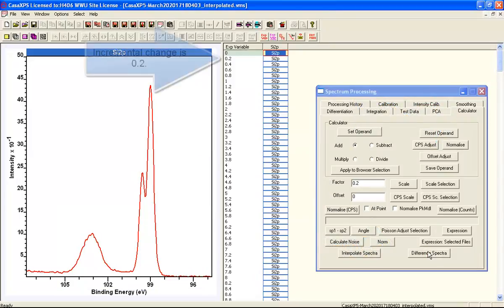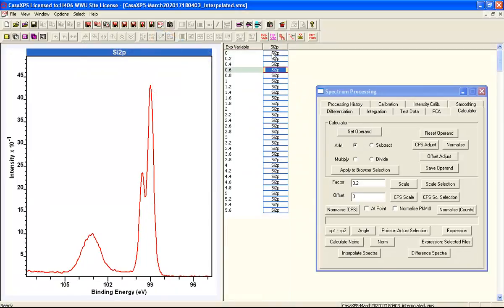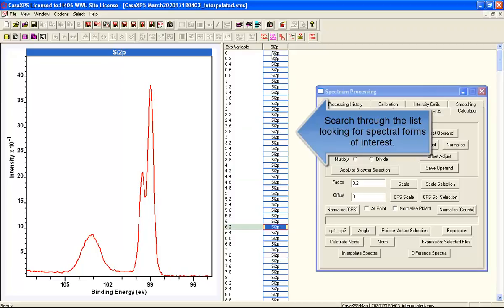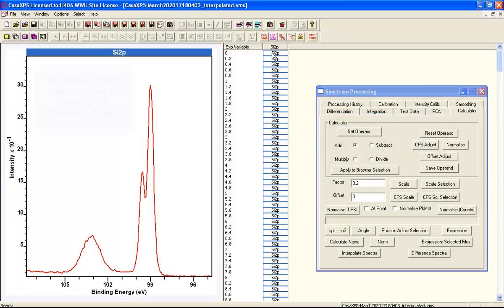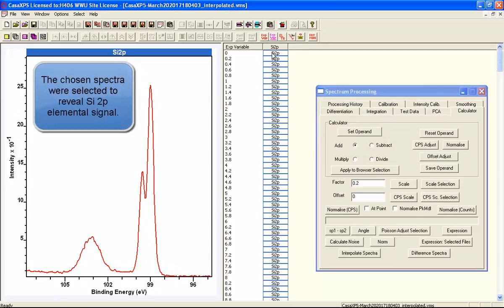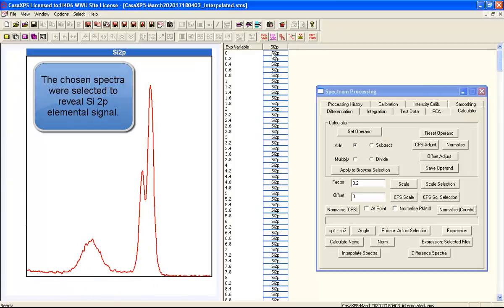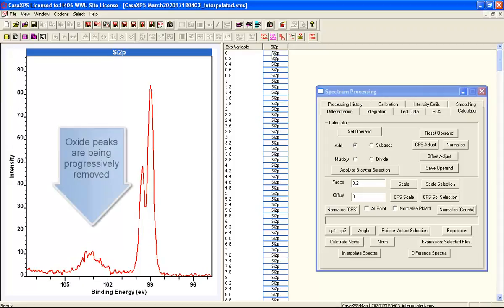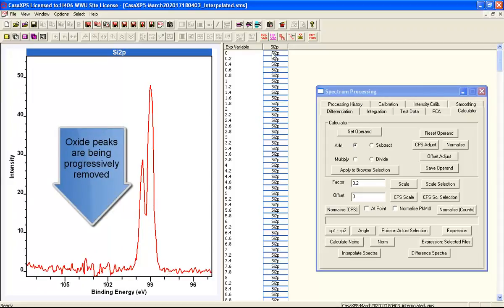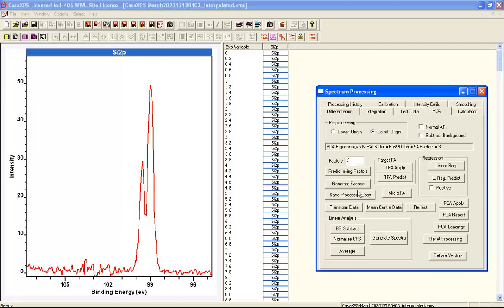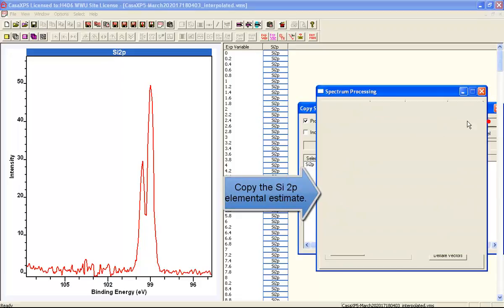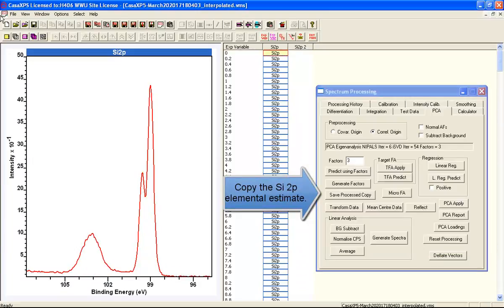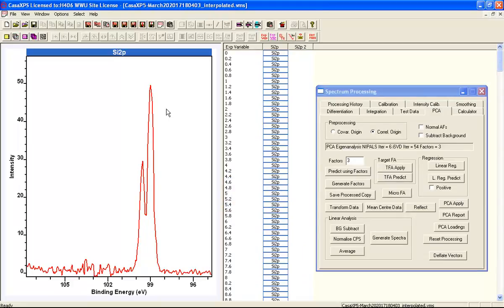The difference spectra are calculated on the calculated property page. The idea is to identify two spectra that will give us complementary information. In this case, what we've selected are two spectra that have a similar oxide but different intensities for the elemental peak. By taking the difference of these spectra and searching through the list, we can end up with a silicon 2P elemental doublet without any oxide — and that's the first obvious component to search for within this data set.